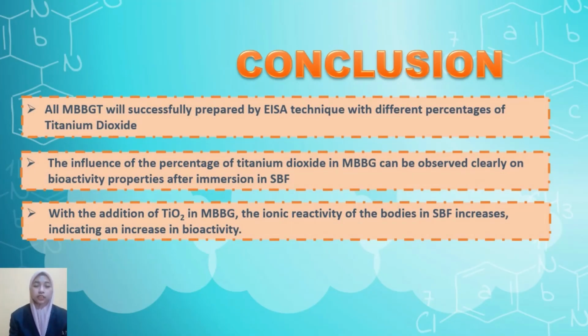For the conclusion, the mesoporous bioactive glass via titanium dioxide inclusion was successfully prepared by the EISA technique with different percentages of titanium dioxide. Second, the influence of the percentage of titanium dioxide in mesoporous bioactive glass can be observed clearly in the bioactivity properties after immersion in simulated body fluid. Lastly, with the addition of titanium dioxide in mesoporous bioactive glass, the ionic reactivity of the glass in simulated body fluid increased, indicating the increase of the bioactivity properties.